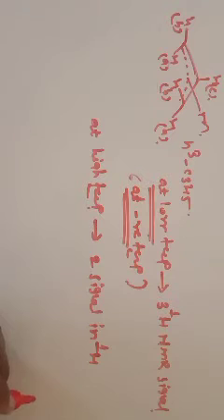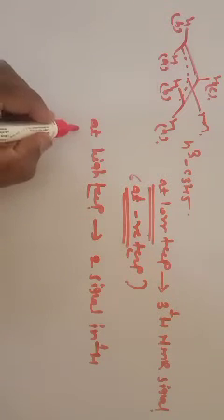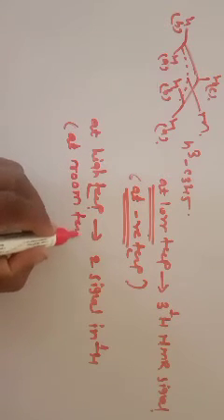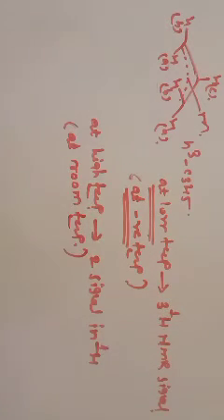because at high temperature, that is at room temperature, this eta 3 C3H5 ligand shows fluxional behavior.